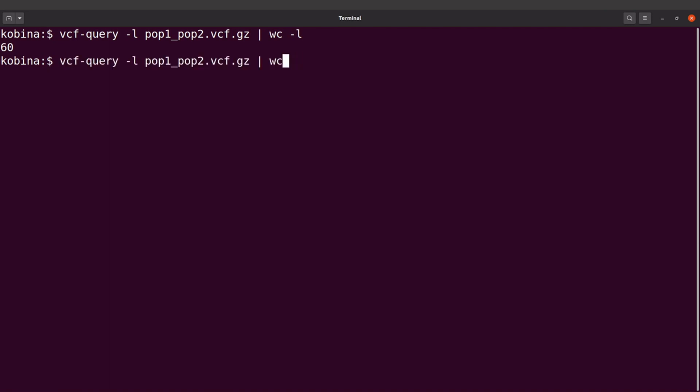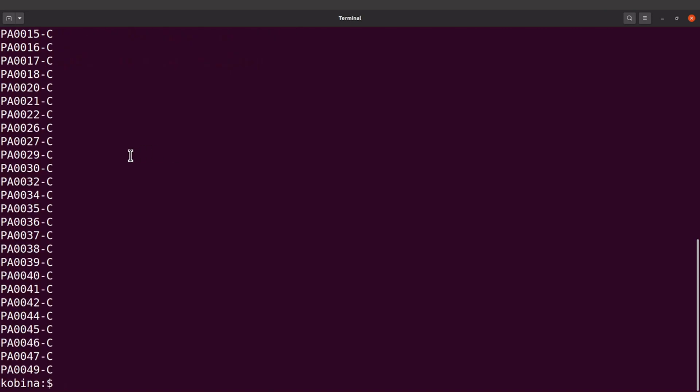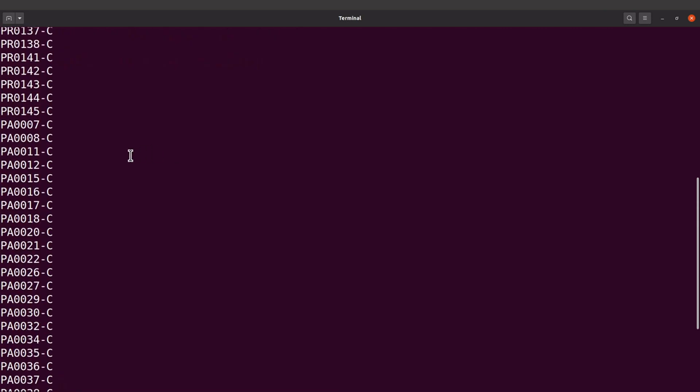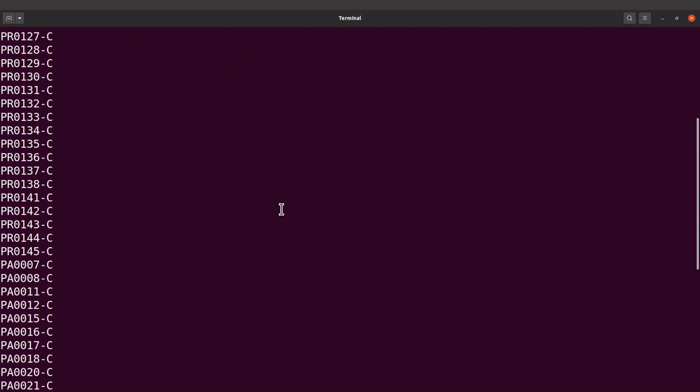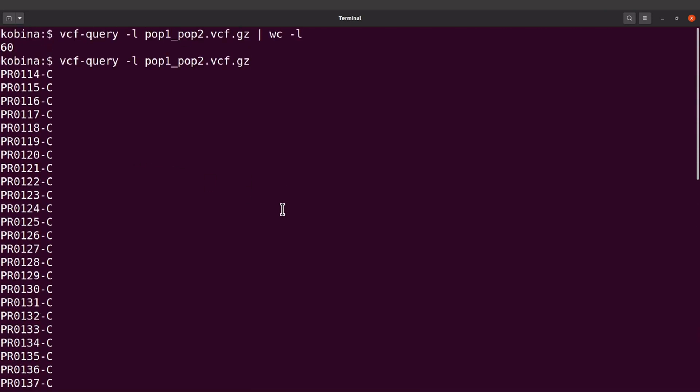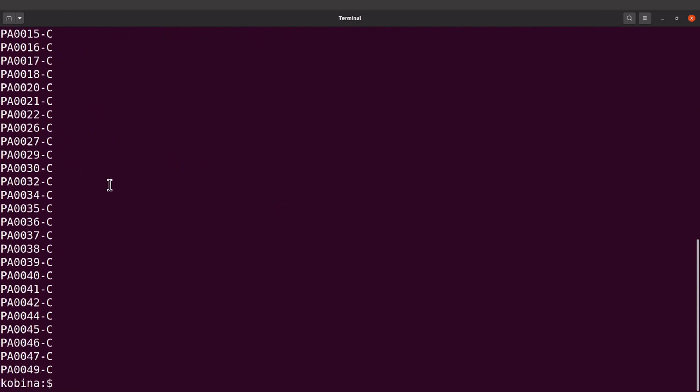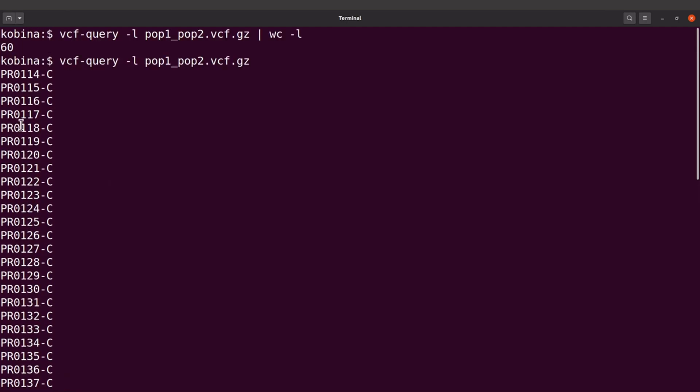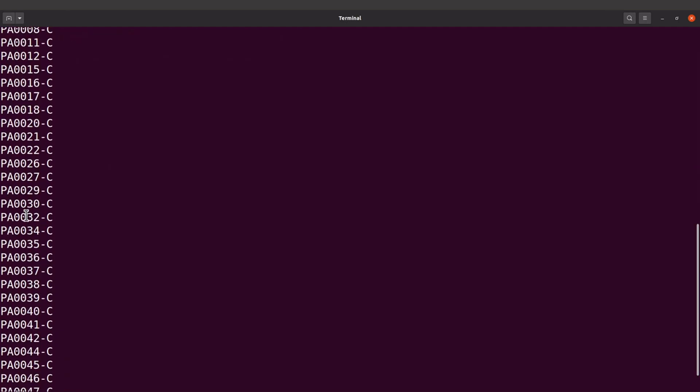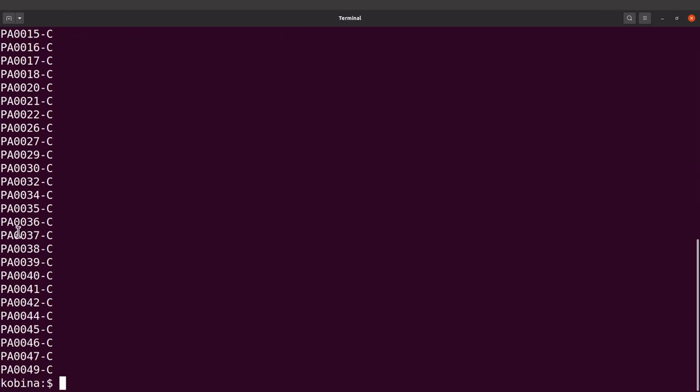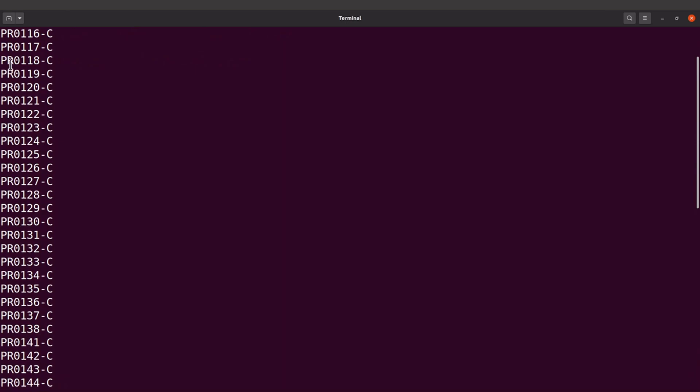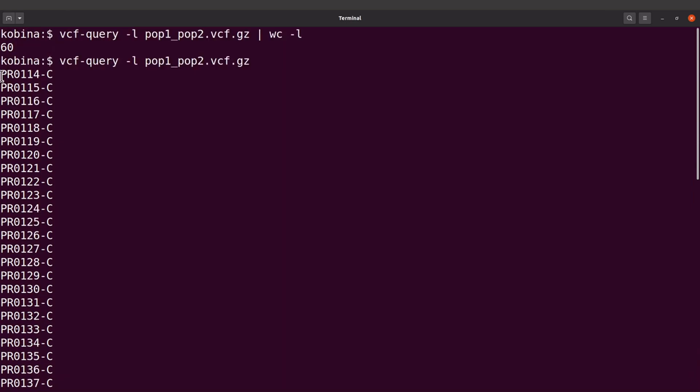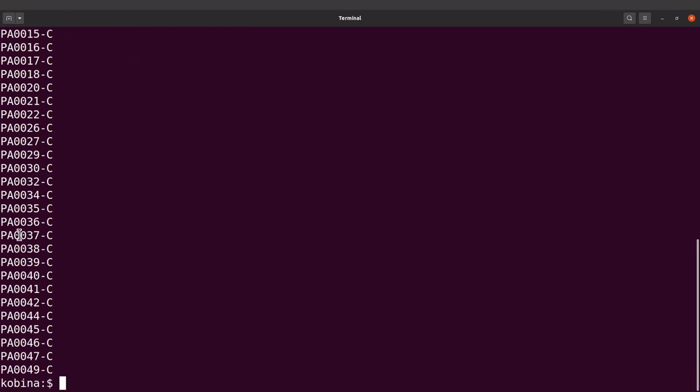So first of all, let's just look at the samples again. I'll use this command this time. Yeah, so I want you to look at the sample names. So I have PR and I also have PA. Okay, so some of the names begin with PR, some begin with PA. So the PR ones are those from Bangladesh and then the PA are those from the Gambia.